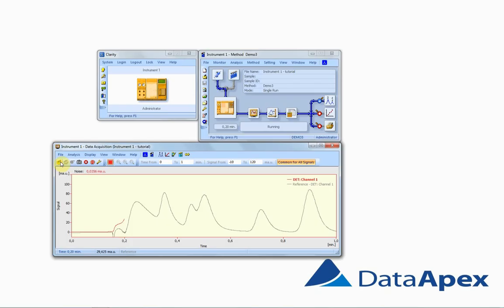Imagine the following situation. Last week I have performed an analysis for a mixture which has yielded precise results. Now I want to measure a similar mixture but with different concentration. I want to check if the current analysis is responding correctly against the measurement, the chromatogram, I have performed last week. In this way, I can easily check if it is yielding expected results.